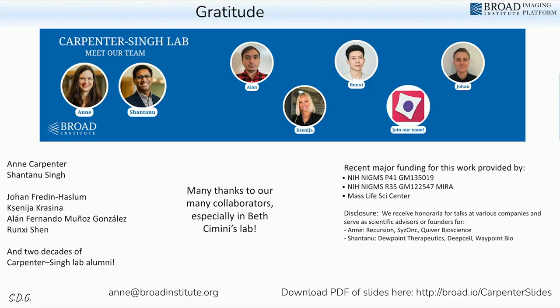That's one strategy to get data out. The other is to just use the bright field only by itself and train on some kind of semi-supervised, weakly supervised approach. Not everybody can just do that. Not everybody has the datasets that are appropriate for that training. So in my perfect world, in a few years from now, somebody has trained a beautiful model that if you feed it a bright field image, it can not only produce all these other channels realistically, but it can also extract a feature profile that is just as powerful.